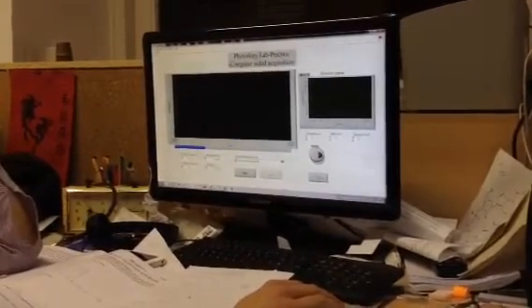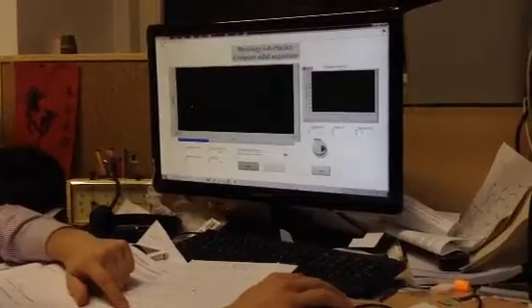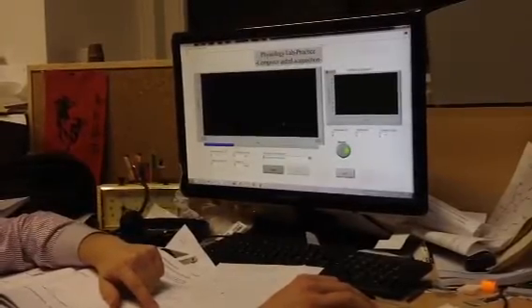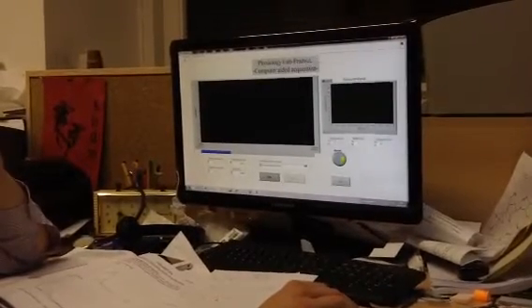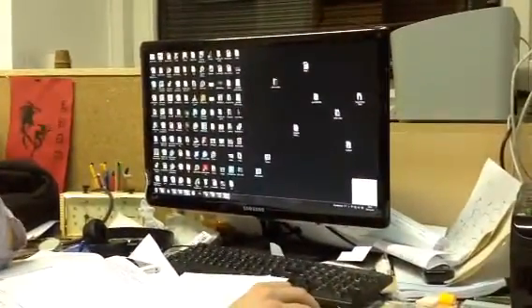This will start it and draw it. Once you add something or change something, you have to press marker, and it will put a marker sign that you changed something. Then when it finishes, it will ask for saving, and of course you have to save it.